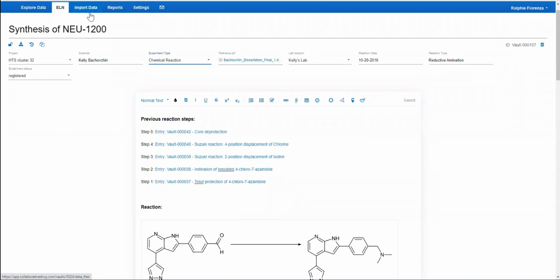This particular entry will highlight the features of the ELN in the context of a chemical reaction. I have filled in a custom title. You can utilize some administrative tools to lock an entry or send it through a witnessing workflow. You can export your entries, view an audit trail, since multiple users can collaborate within an ELN entry at the same time, depending on their permissions, and you can even duplicate an ELN entry. This allows you to predefine templates for your users to work off of.